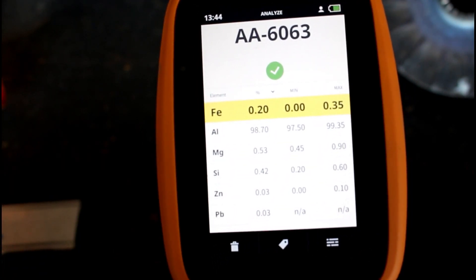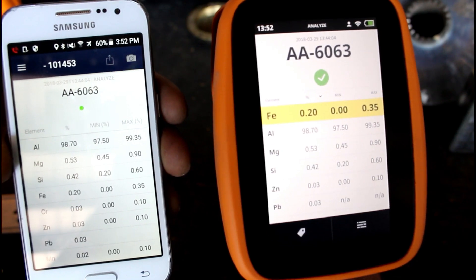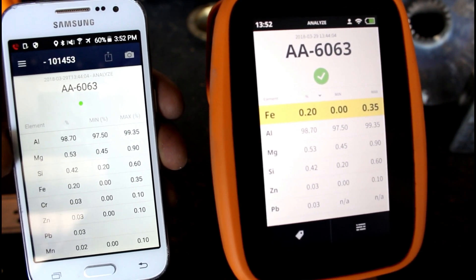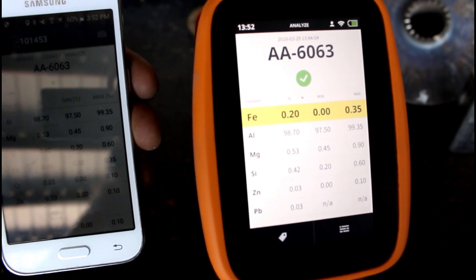It gives you a breakdown of all the chemistries and the percentages that are in it. And check this out — if you have an Android phone, you can even sync it to your phone. And I think they're working on getting it synced to iPhones, right Vidal? That's correct.